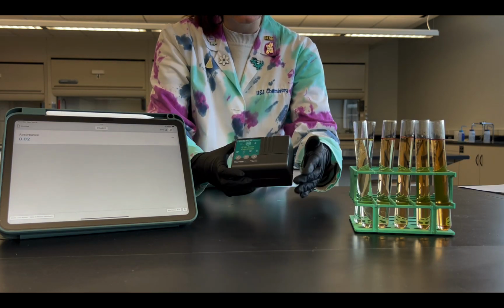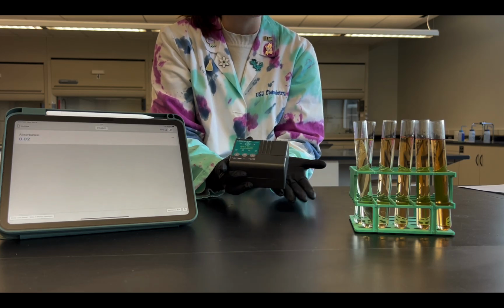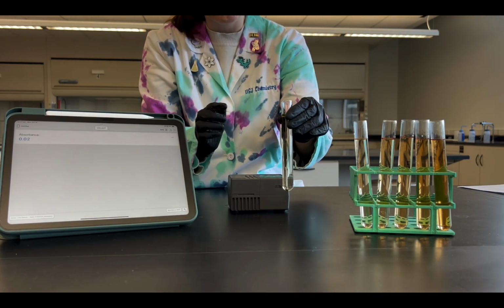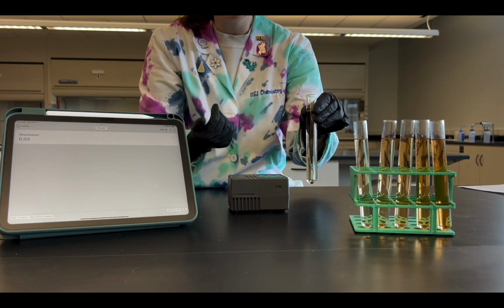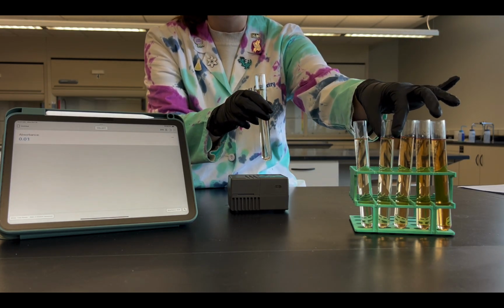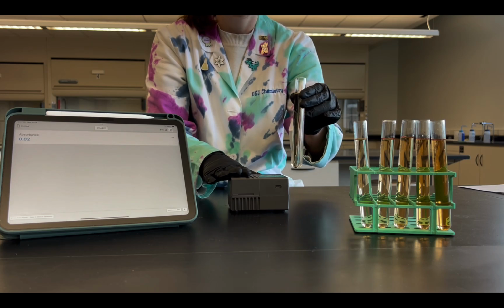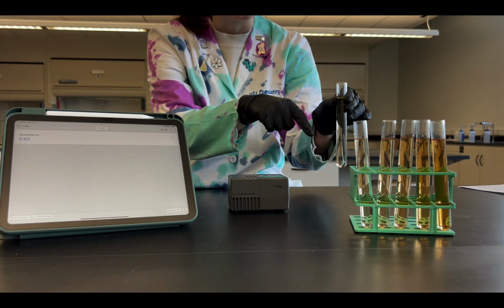Now ideally when it's closed and no solution is in there, we should read 0. But as we discussed before, I have a solution that we refer to as a blank. Because this iron nitrate solution has a color to it, and the iron thiocyanate solution has a slightly different color, I'm going to blank out my colorimeter, my spectrophotometer, and basically say, ignore this color and only focus on the other color.